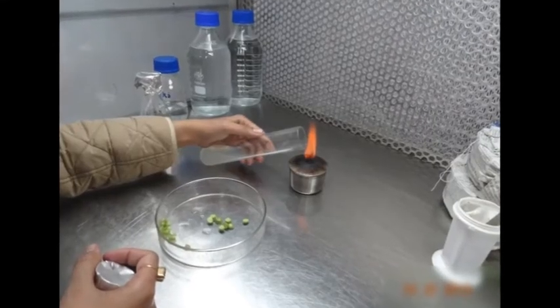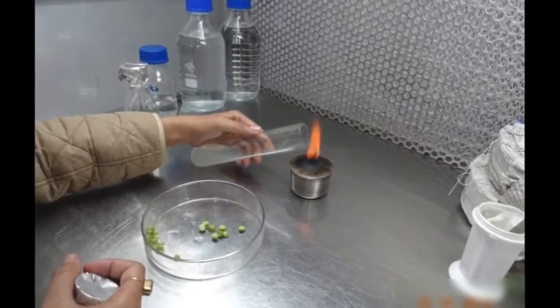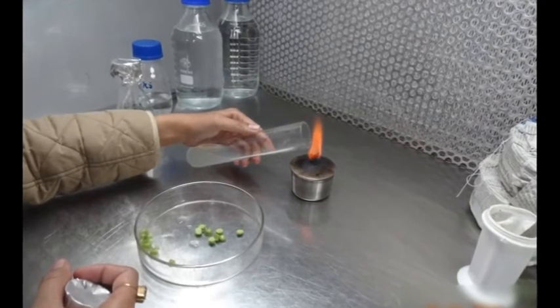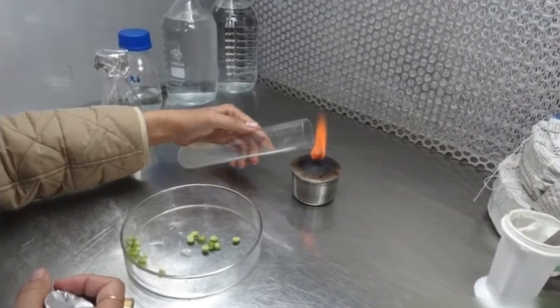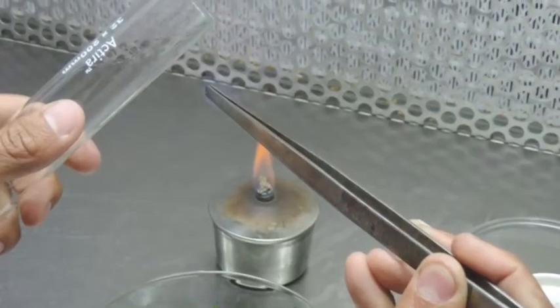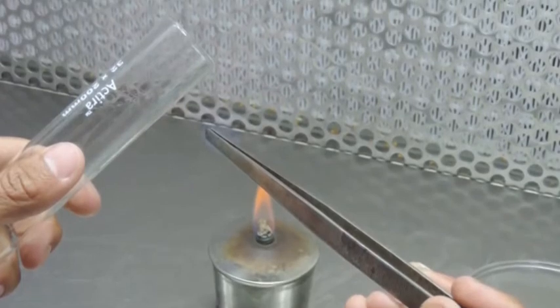Now open the cotton plug of the culture tube containing MS medium supplemented with 3 mg per liter 2,4-D and flame the mouth of the tube. Flame the forceps and cool them by touching the medium in the culture tube.